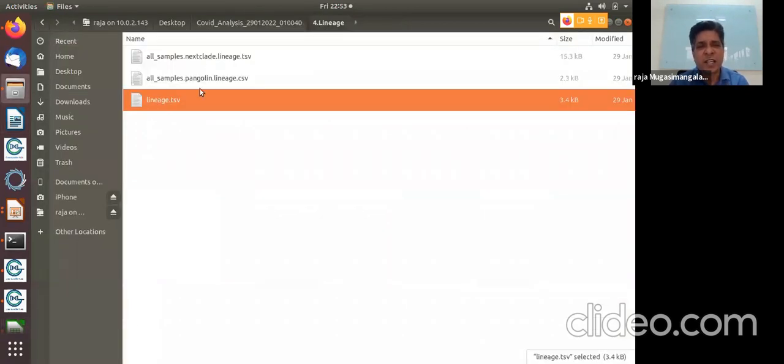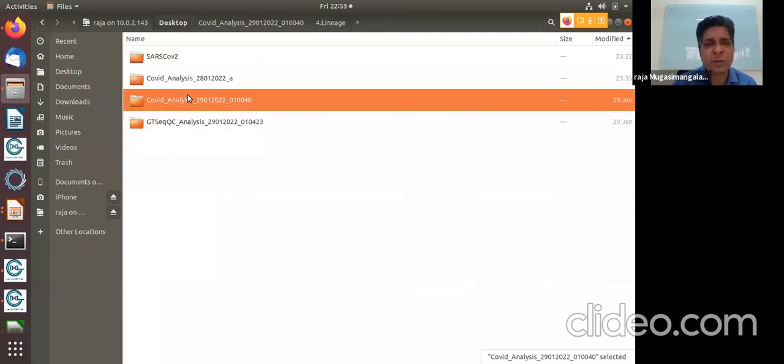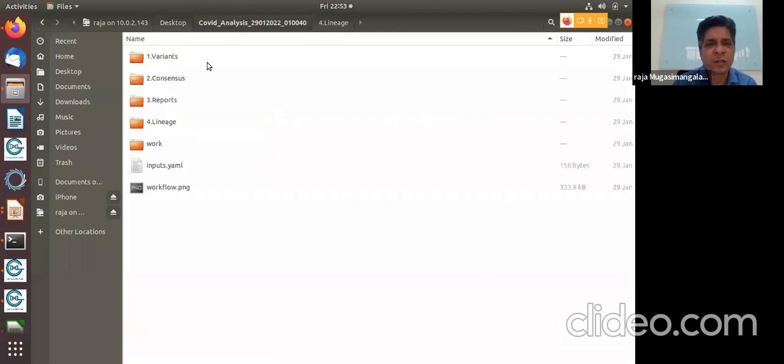See, this Nextclade and Pangolin have also given us separate files. See, if you don't use this, what will you do? I will go and show you. What will you end up doing? Okay, I'm sorry. Here.